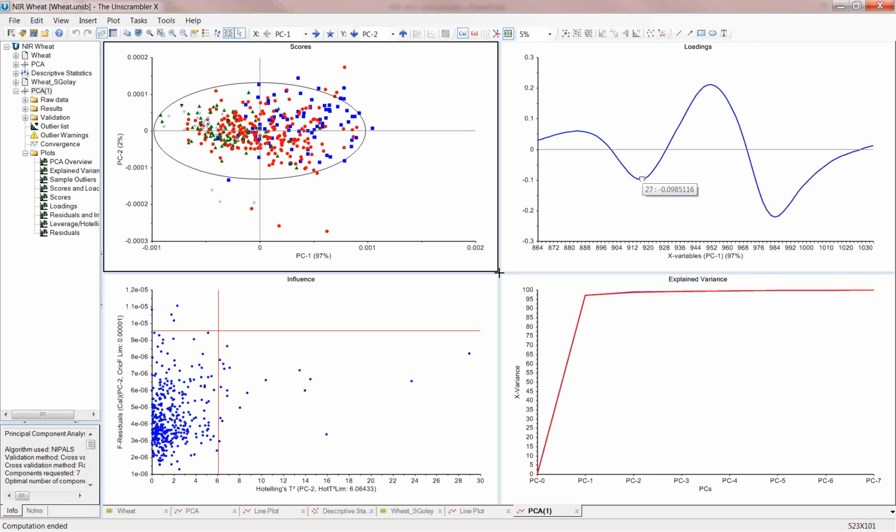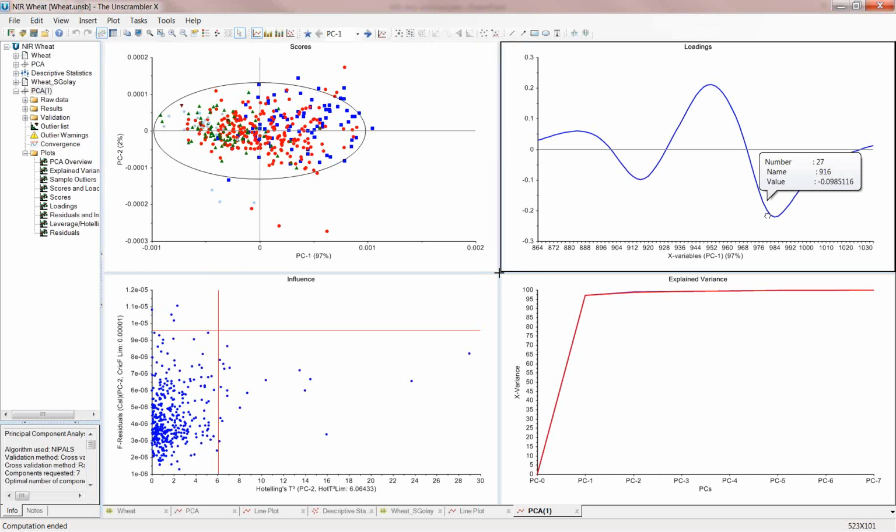First derivatives get a little tricky because in a second derivative like this, the peak is in the same position, right? So this peak and this peak were actual peaks in the original data. When you're looking at a first derivative, the peaks are actually where the lines cross zero. So it makes it a little bit trickier to interpret. And so I tend to not use them that much for that reason, unless there's a really known justification for doing a first derivative.